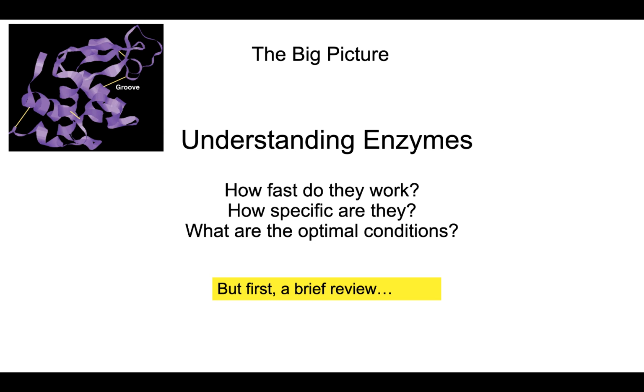In this week's lab, you're going to be again donning the hat of a biochemist who is interested in characterizing an enzyme. Now remember, an enzyme is usually a protein that catalyzes biochemical reactions. And in trying to understand an enzyme, there's all sorts of questions that one would ask. How fast do they work? How specific are they? And what are their optimal conditions?